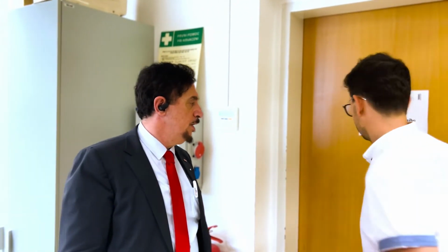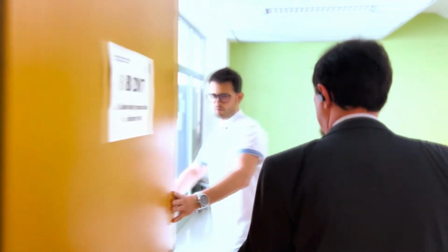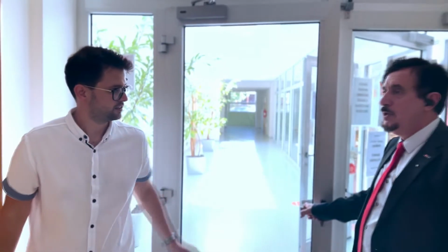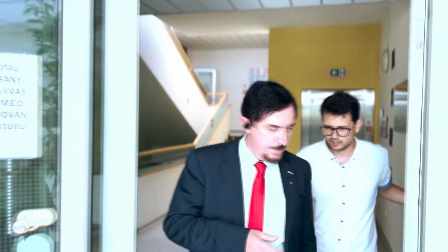What are the most important for nutrition? We can go there and see. Okay. What are the most important ones? The most important ones are nitrogen, phosphorus, and potassium, which are the main fertilizer components. You need nitrogen, right? Yes, we need nitrogen, and basically the protein fertilizer is like a nitrogen fertilizer.